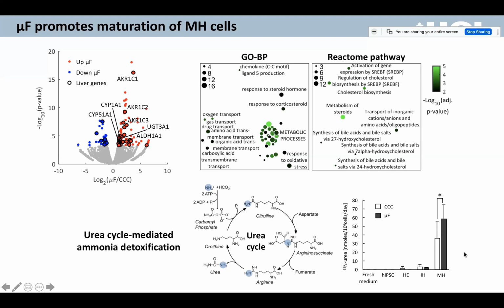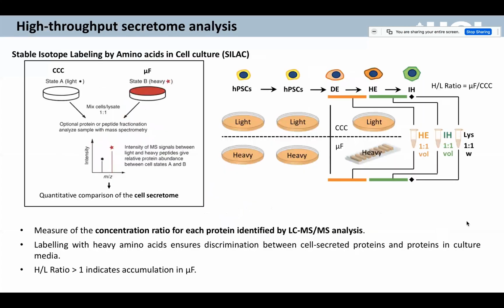And what we notice is that fully committed hepatocytes derived in microfluidics actually display higher functional activities in terms of ammonia detoxification compared to those derived in Petri dish. So then we asked what it is in microfluidics that contributes to a more mature phenotype.